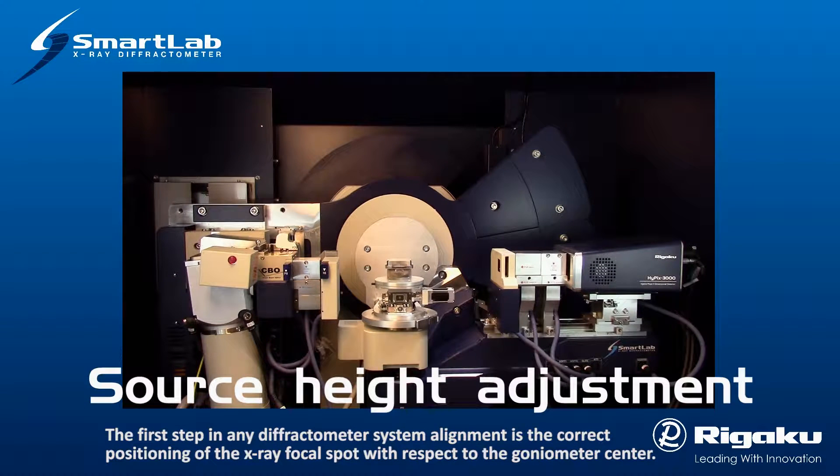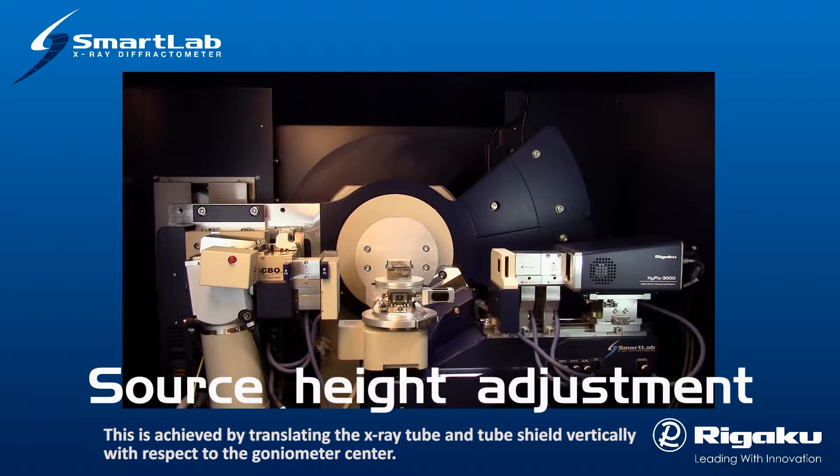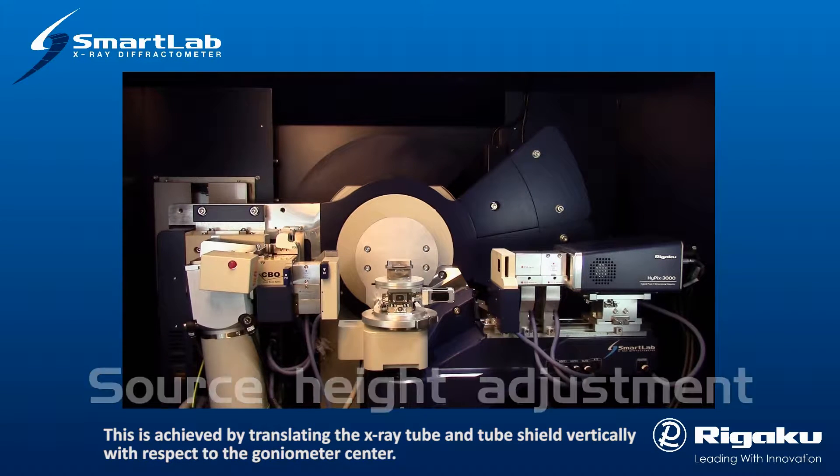The first step in any diffractometer system alignment is the correct positioning of the X-ray focal spot with respect to the goniometer center. This is achieved by translating the X-ray tube and tube shield vertically with respect to the goniometer center.